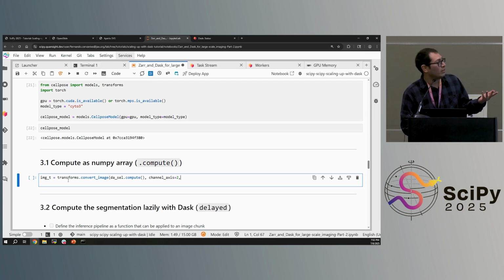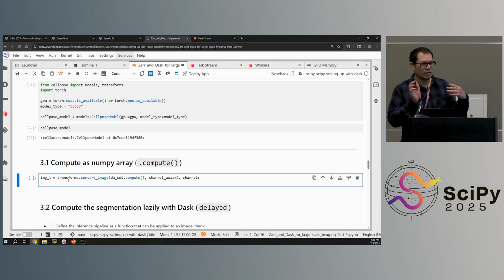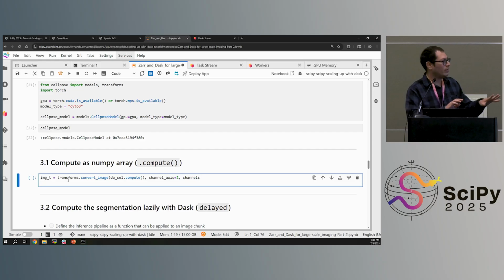After that, you will be able to show your image and overlay on top the output that you would be obtaining from that. So this will be the result of applying this naive thresholding method for detecting nuclei.